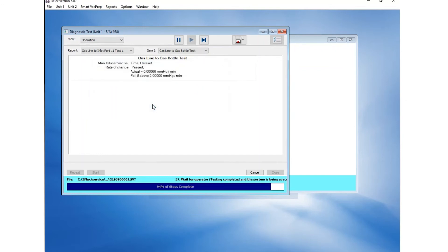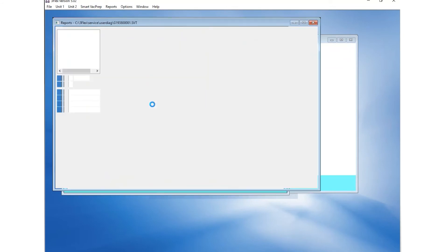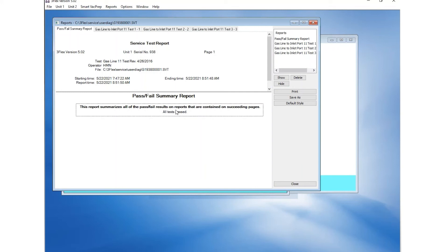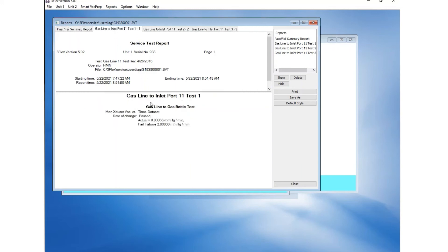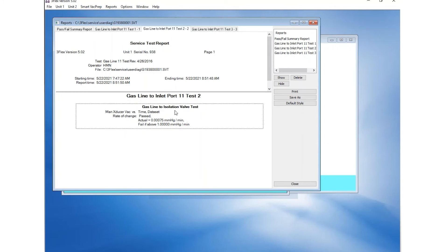The test is now complete. There are three tabs on the report. Check that all three passed. If there are any tabs that failed, correct the leaks indicated on the report and then rerun the test.